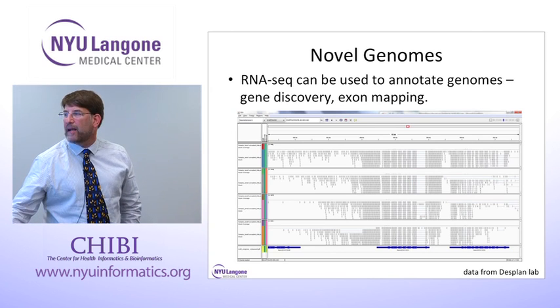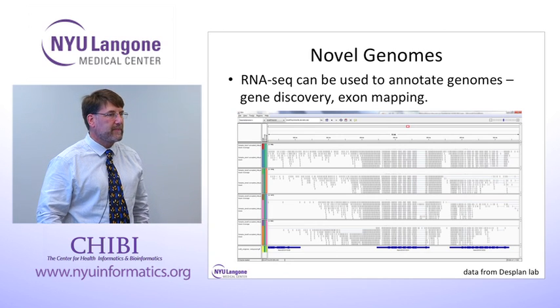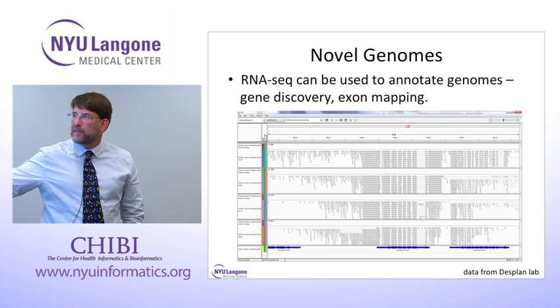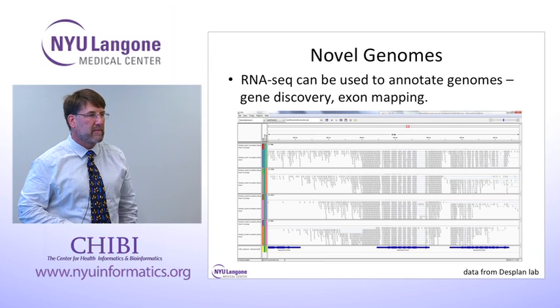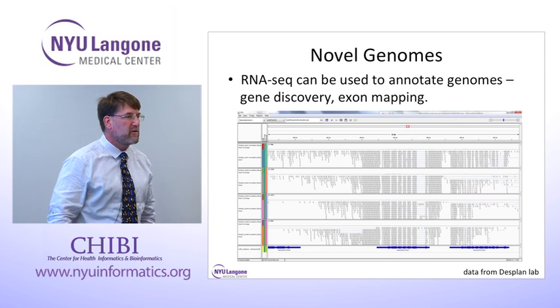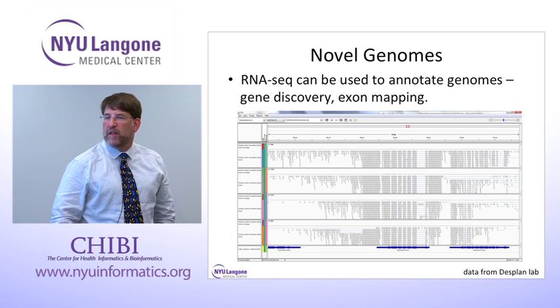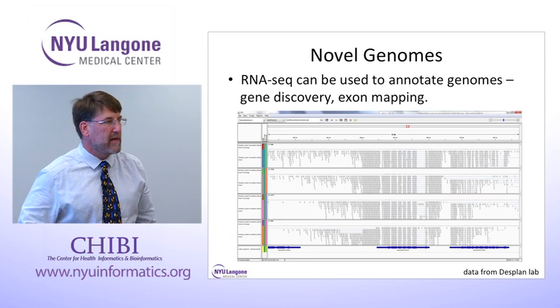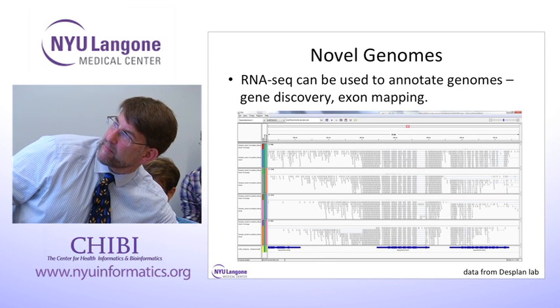So these are exons, exon, exon, exon, intron, exon, et cetera. And then you could also use this same map to, say, do differential expression between different tissues of the same organism, or any kind of experimental treatment that you would want. So you're not completely without any recourse if you lack a good genome annotation. It could be built by bootstrapping from the ground up.